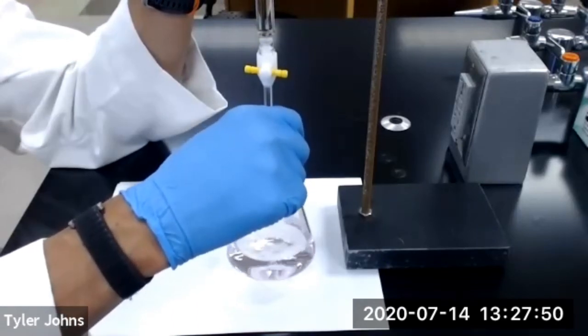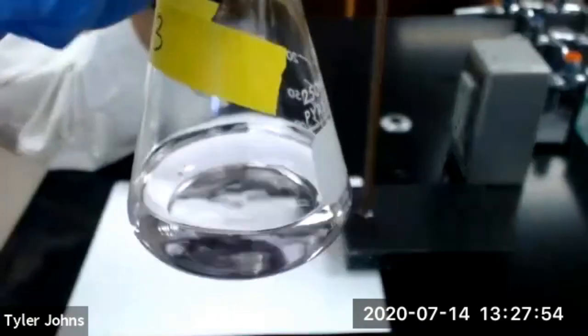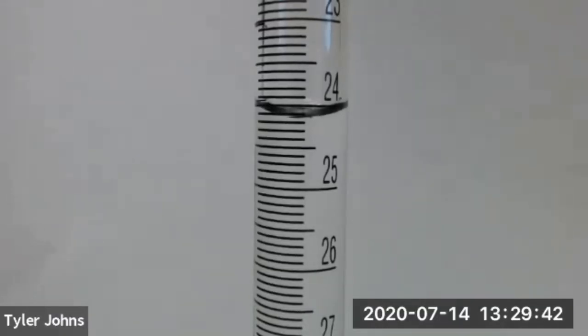We now have a persistent very faint pink color, and so we have reached the endpoint of trial number three. This is the final burette reading for trial number three.